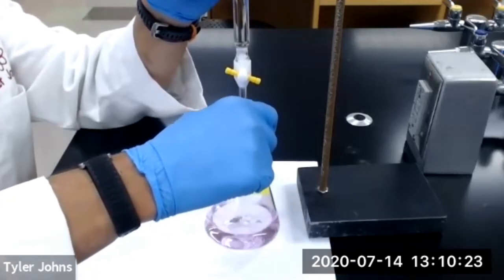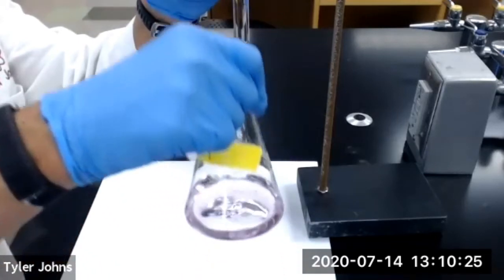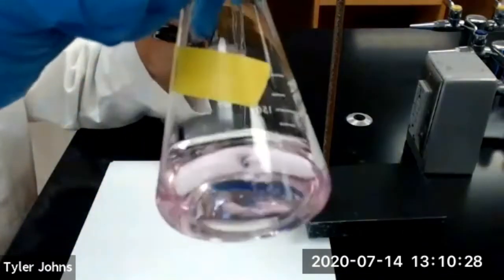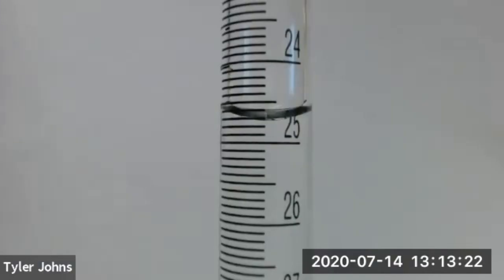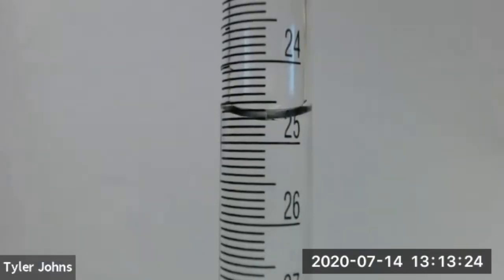We now have a persistent faint pink color, so we have reached the endpoint of trial number one. This is the final burette reading for trial number one.